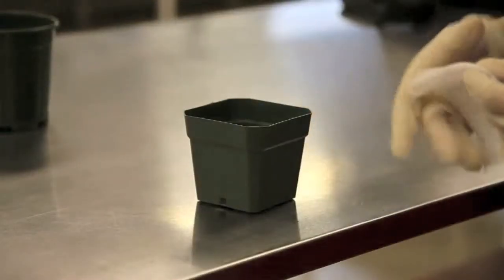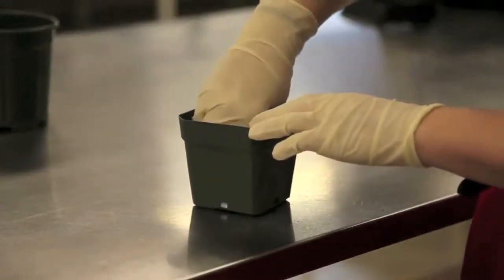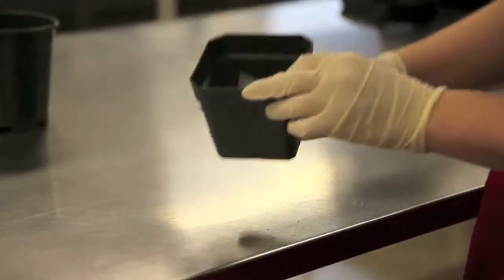Now it's time to prepare your pots. Start by placing a piece of cheesecloth at the bottom of each pot. This will keep your soil from escaping when you water them in the future.